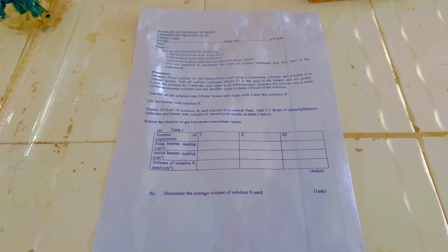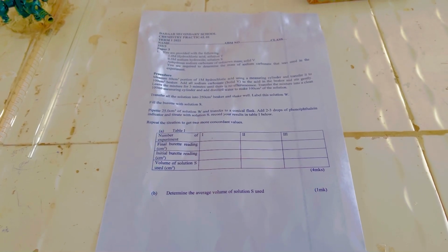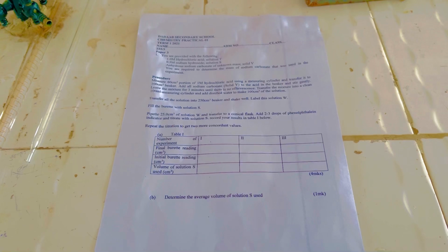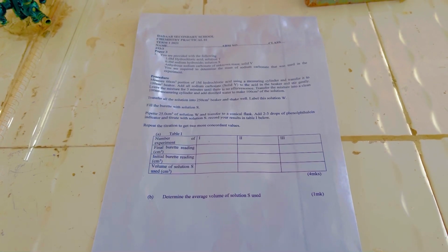Titration is one of the analyses tested in KCSE Chemistry Paper 3 as a quantitative analysis. Here with me is someone who is going to demonstrate titration that involves back titration.